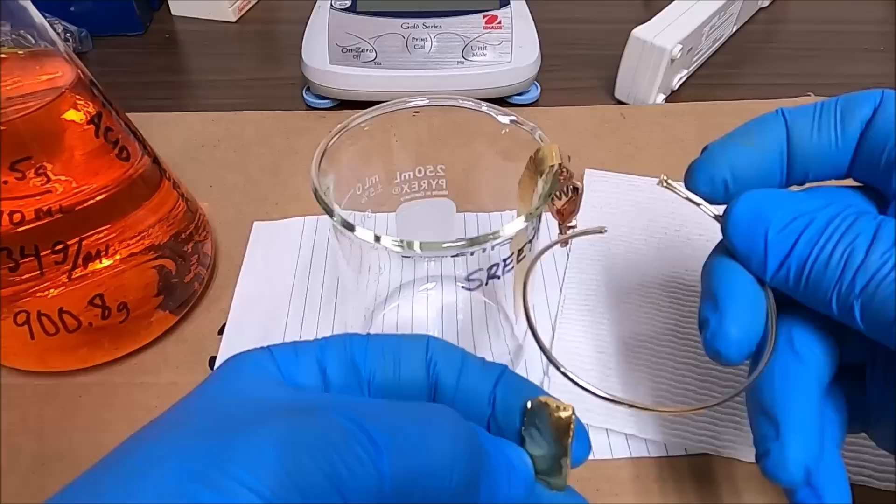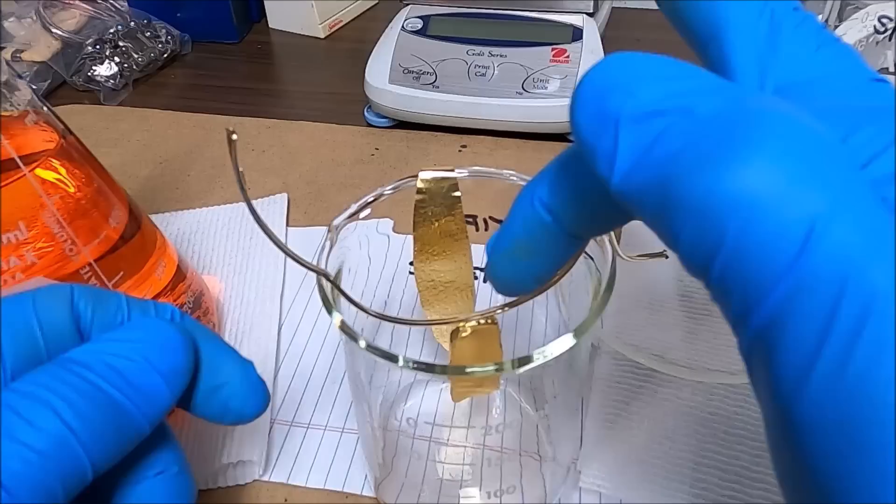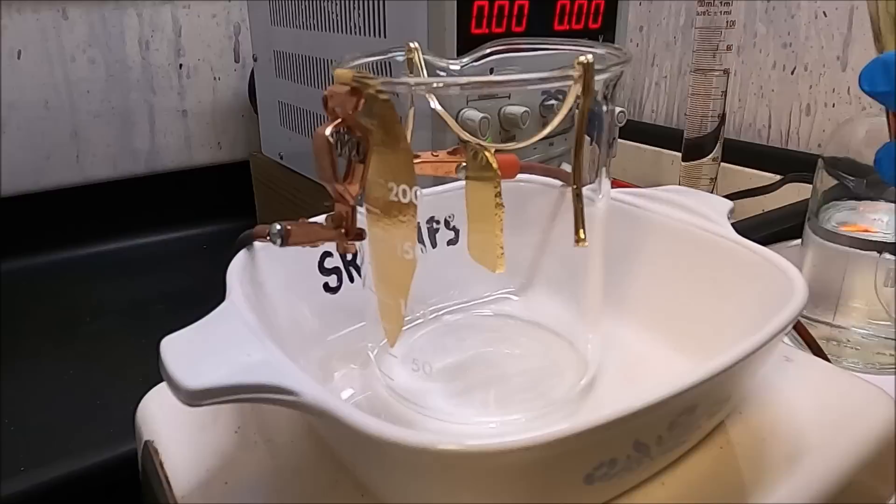I clip the pure gold cathode on the side of the cell with a copper clip. I've got an impure gold anode bar and I have my jeweler friend solder it onto a piece of 14k gold wire so we can suspend it in the cell.